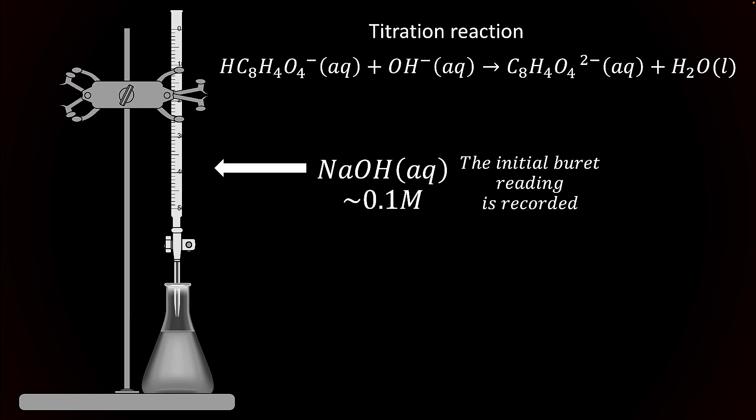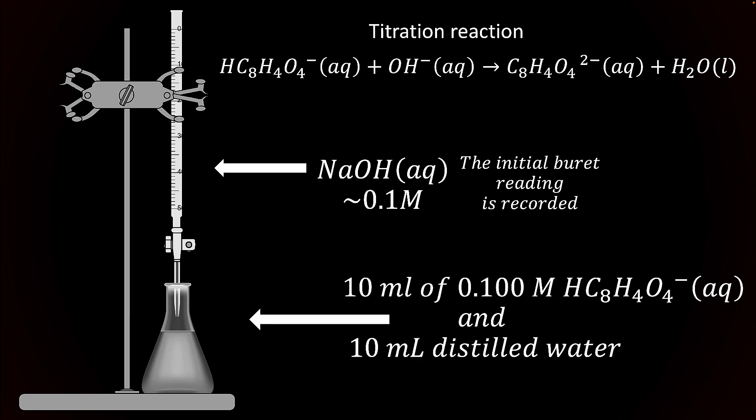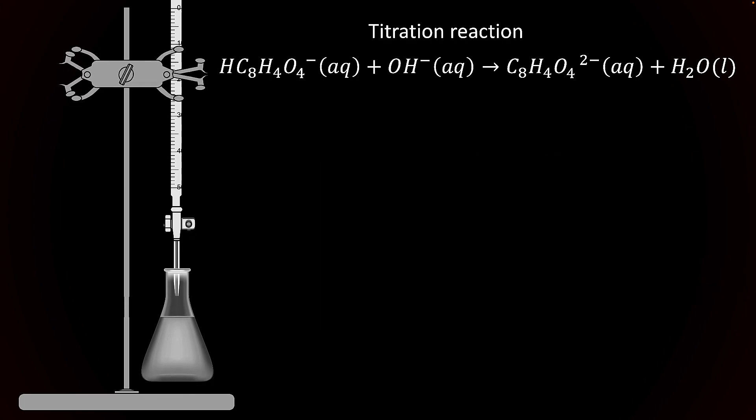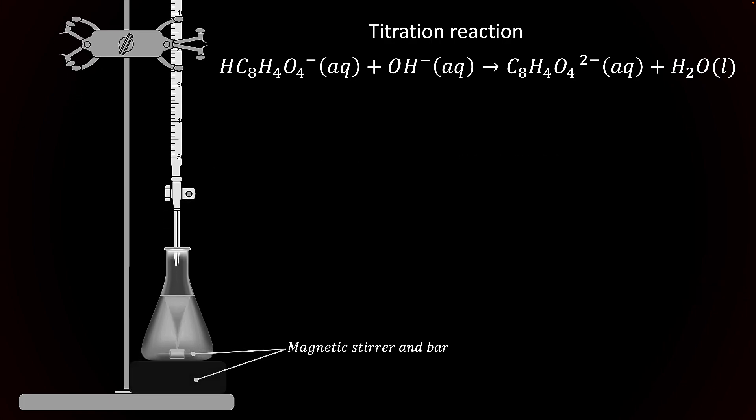The burette is read at this point to obtain an initial reading. We will add 10 milliliters of 0.100 molar potassium acid phthalate solution to an Erlenmeyer flask with 10 milliliters of water. We'll use a magnetic stirrer for this application.